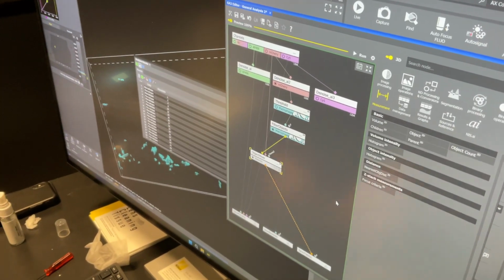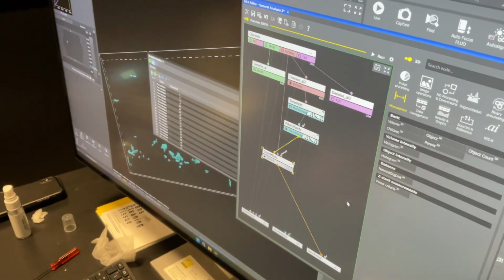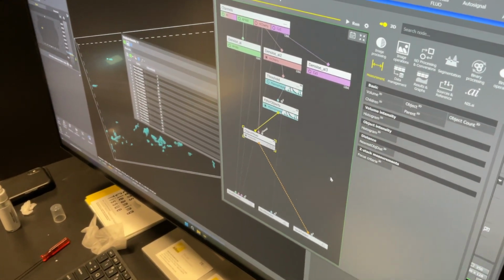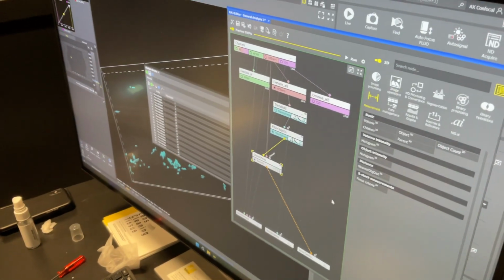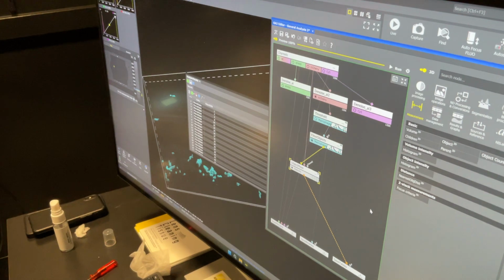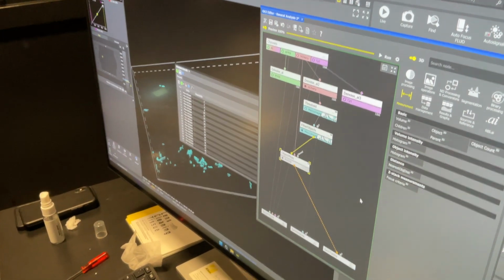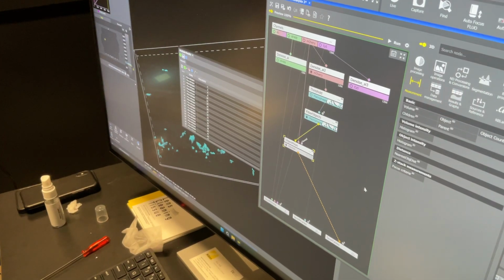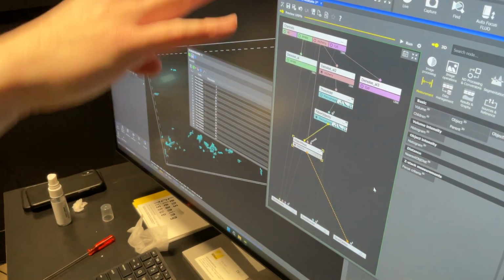Makes sense. This allows you to do all sorts of things to the image you might need to do to make segmenting it easier, but then still measure your raw data. No more reference images, no more taking this image, holding it as a reference, doing your stuff to it, making your layer, and then substituting back in your reference image, and then measuring your data through that. It's all in a flow.